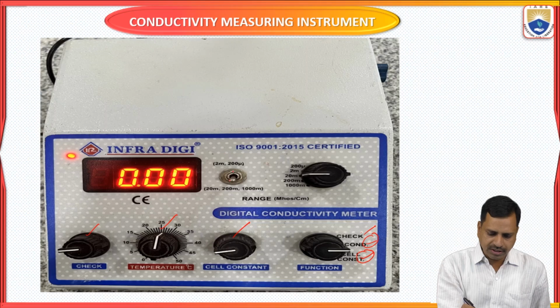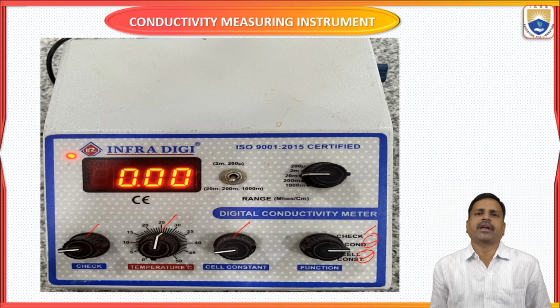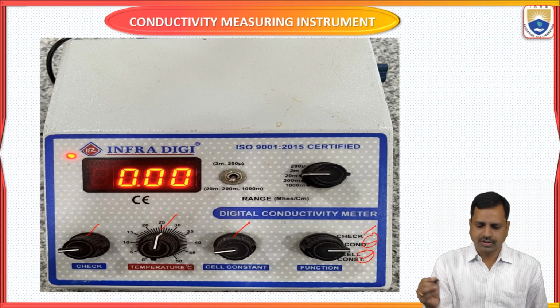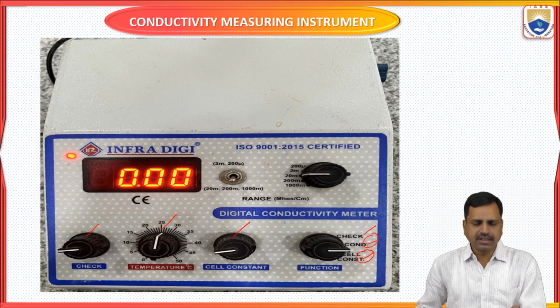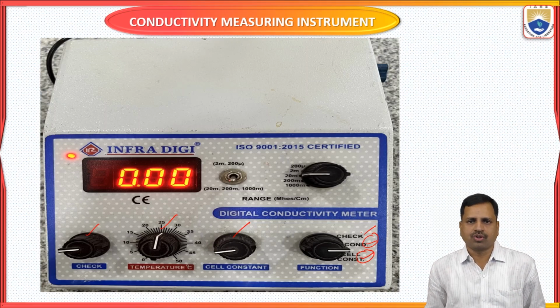And this is the unit. So what are the units of conductivity? Conductance is measured in Siemens or microsiemens. Siemens is nothing but ohm inverse. The units of conductivity are Siemens or ohm inverse. The conductivity of the solution is very small, so that's why we measure the conductivity in microsiemens. This is the conductivity instrument, and with its help we are going to estimate the conductivity of the solution.